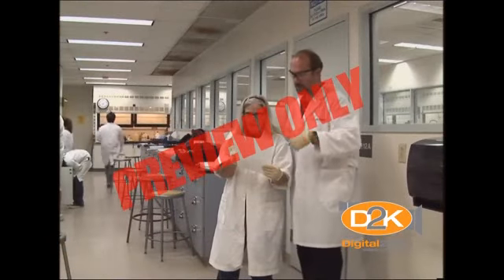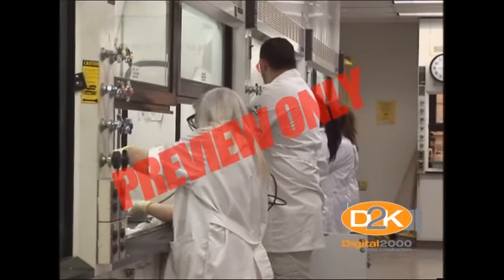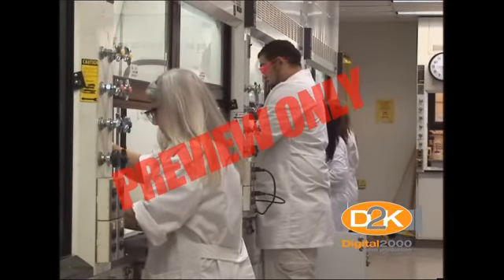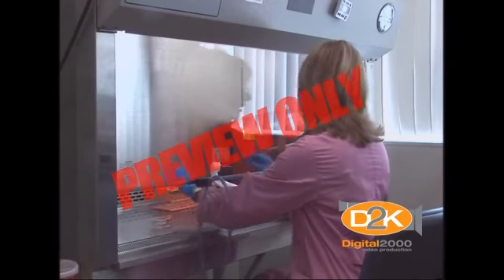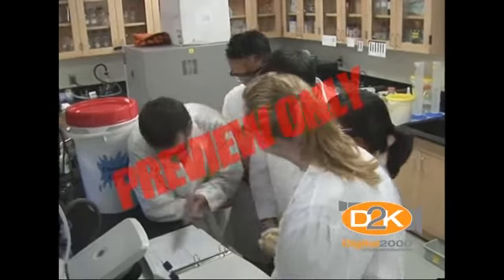Laboratory safety training in instructional laboratories will be provided by your professor or course instructor. This training will include a discussion of the risks associated with substances used and procedures to be performed, proper techniques for handling and disposing of hazardous substances, safety precautions to be used to prevent exposure or release into the environment, and emergency and spill procedures.